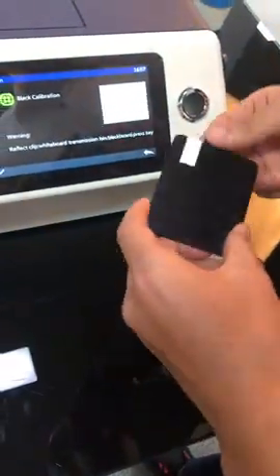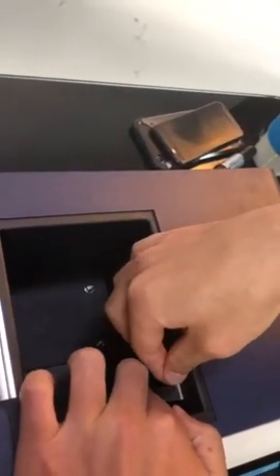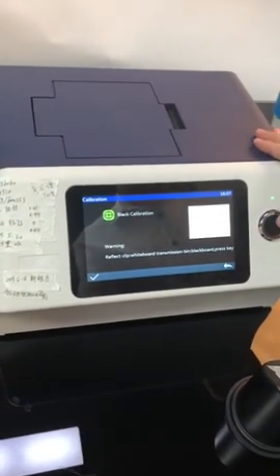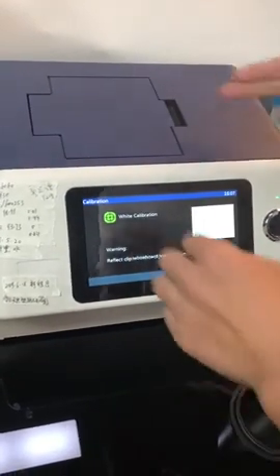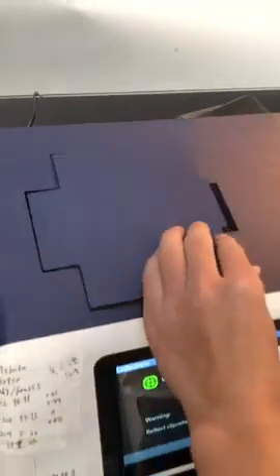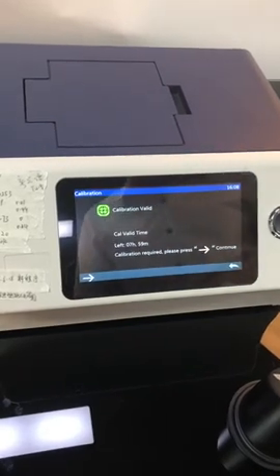And put this black board here at the transmissive measurement port. Let's press this button. Now let's do the white calibration. For the white calibration, we just need to take the black board out and press the button. The calibration is done.